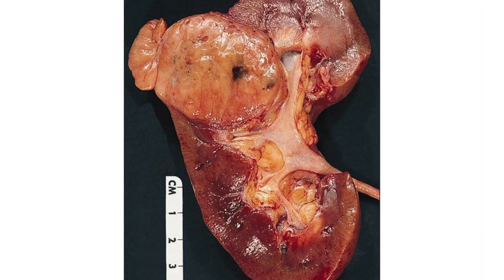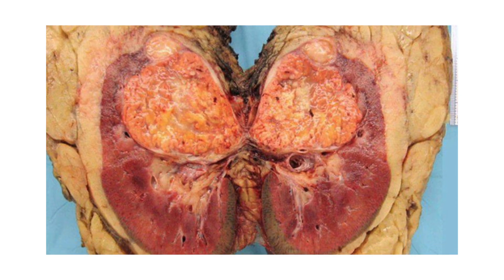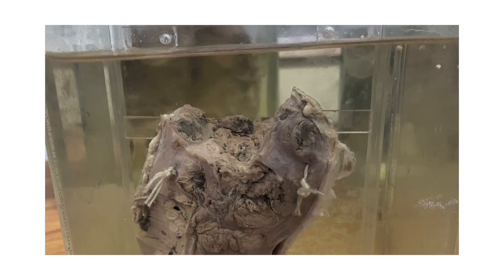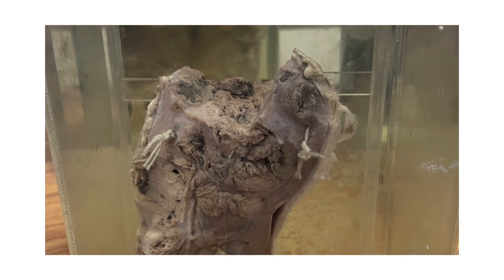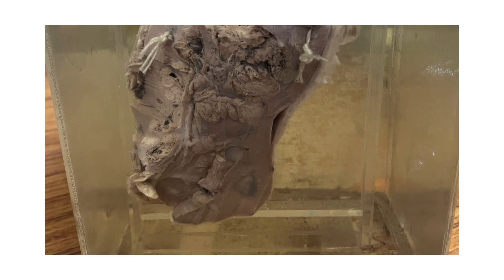Most likely the specimen is of renal cell carcinoma, which is the malignant transformation of the tubular cells lining the kidney. It is characterized by a large, solitary, golden yellowish and circumscribed tumor, most commonly affecting the upper pole of the kidney. It is usually unilateral. The tumor, once developed, would eventually grow and compress the calyces and renal pelvis in the lower poles as well.